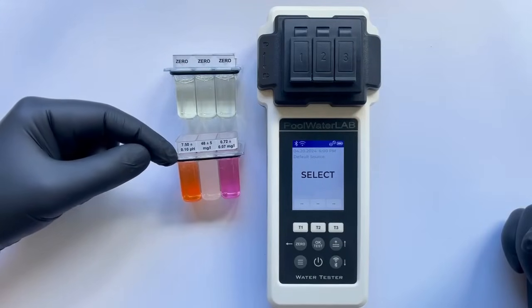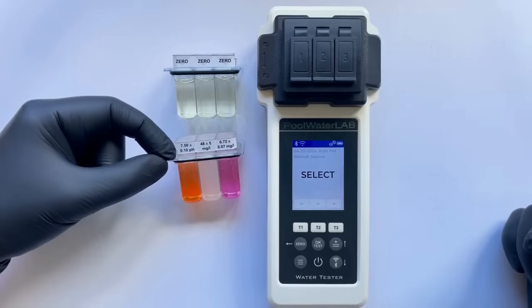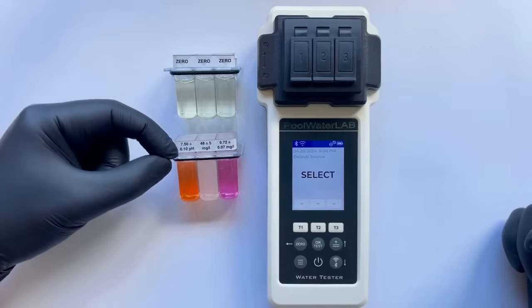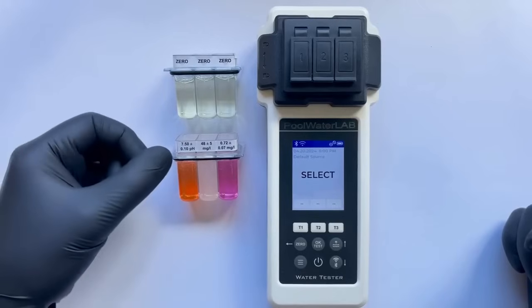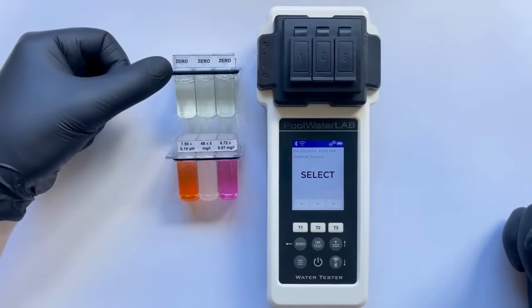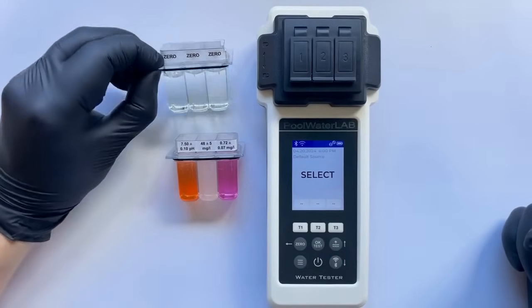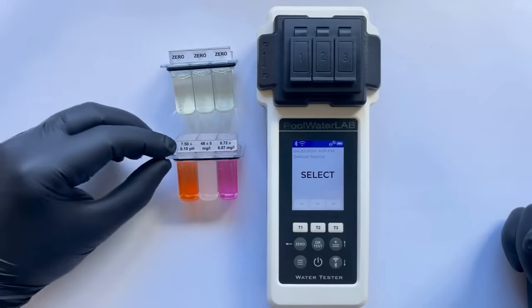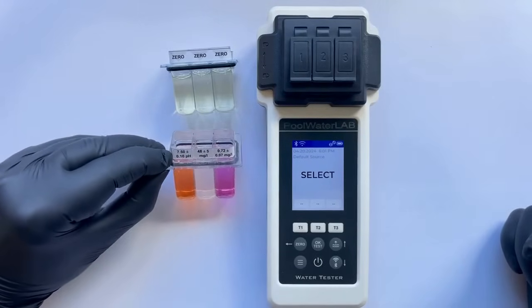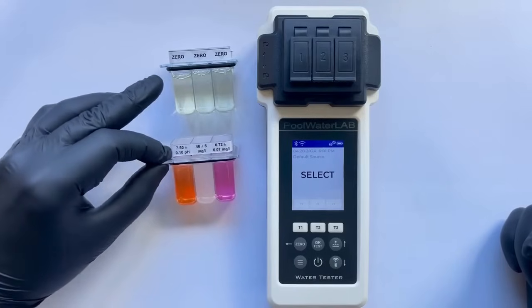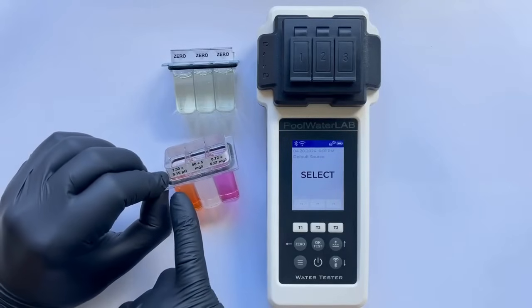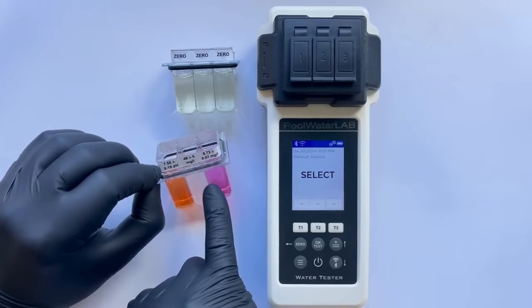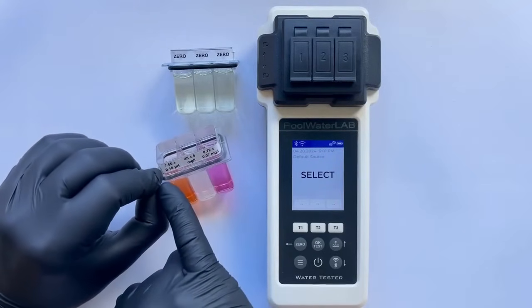Therefore, we currently have samples of pure water for the zero test, which is used to calibrate the tester and ensure it reads zero in the absence of contaminants. Additionally, we have a sample of this same water mixed with specific reagents. These reagents are added to measure the tester's response to changes in pH, CYA, and free chlorine levels under controlled laboratory conditions.